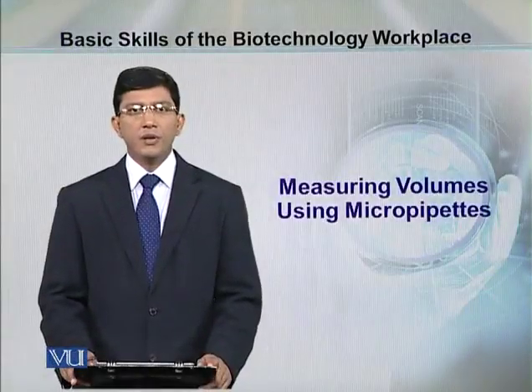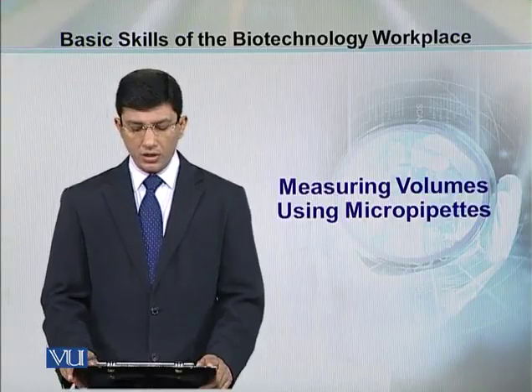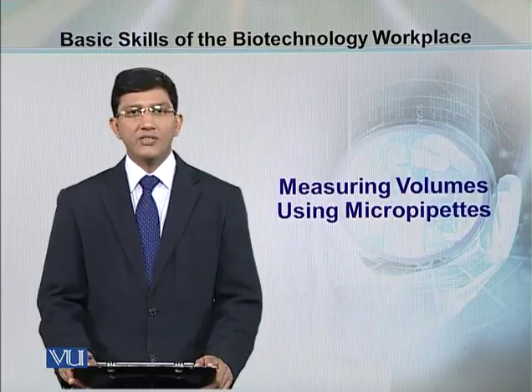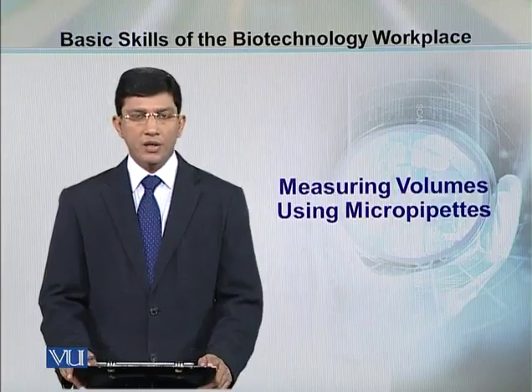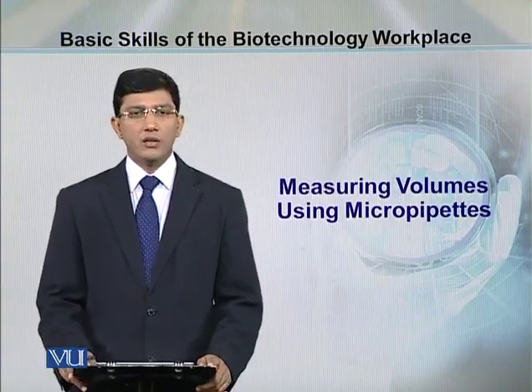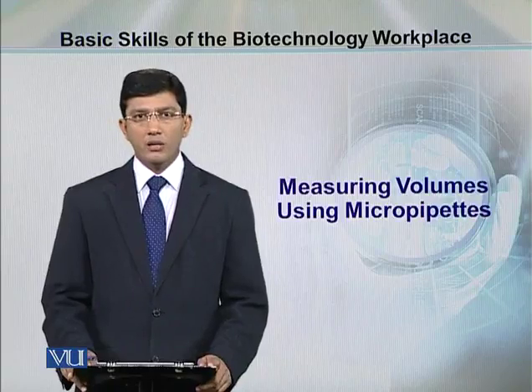Dear students, in this module, we are going to see how to measure the volumes which are less than 1 milliliter. इससे पहले जो हमने दो modules की बात की है, there we talked about measuring the volumes above 1 milliliter.